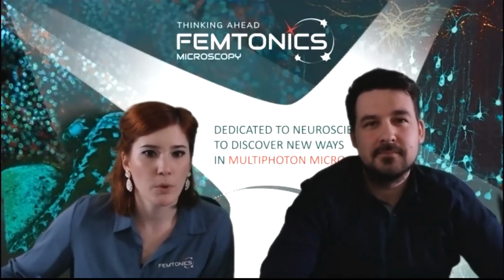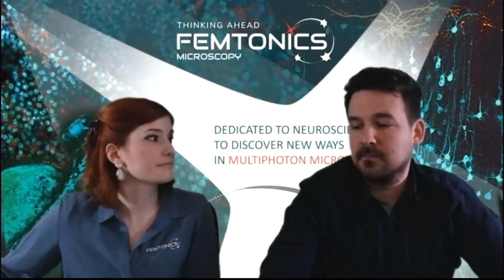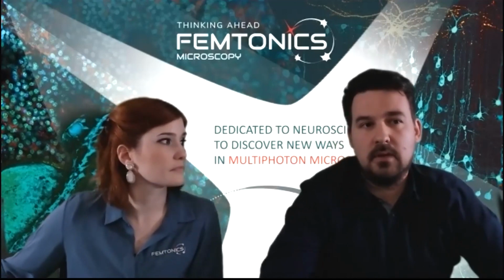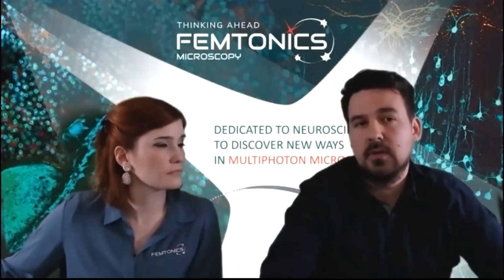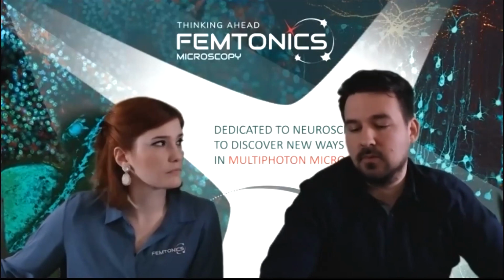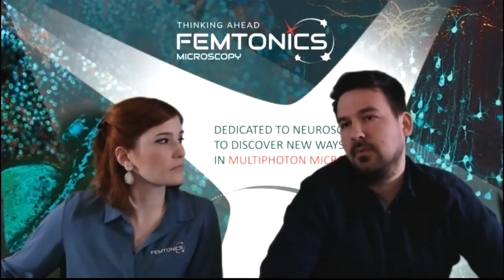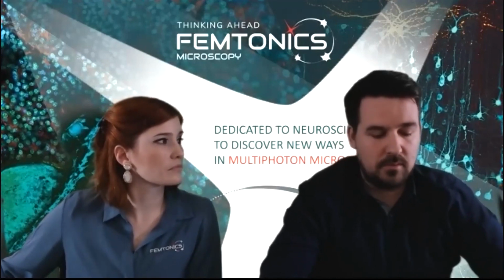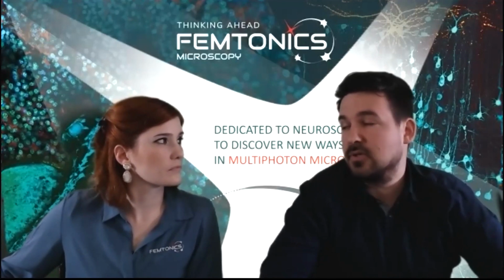I have a lot of motion caused by animal movement. What solutions can FEMTOSmart offer for that? I always advise that improving the surgery technique is the best solution to reduce the movement artifacts. But if you cannot avoid this, then you can use rigid and non-rigid motion correction after the measurement.